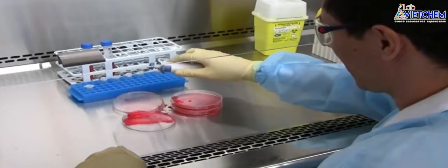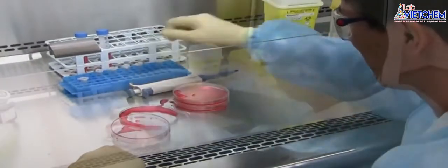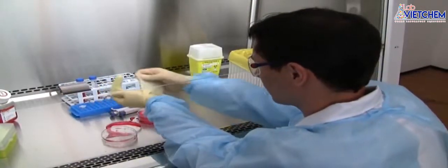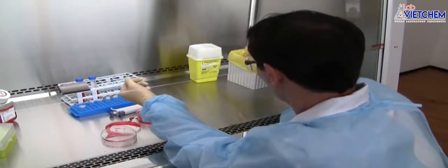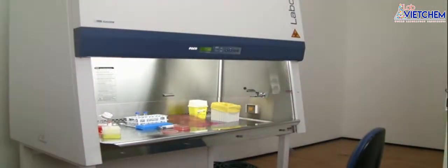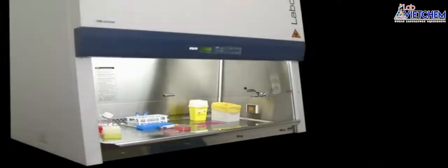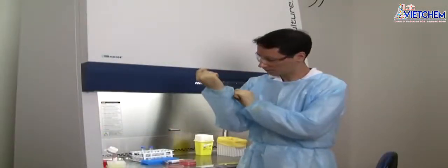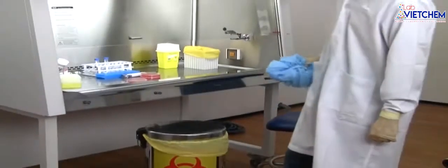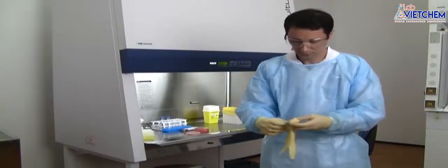If a spill should occur while working in the cabinet, do not turn the cabinet off. Remove your outer gloves inside the BSC as they may have become contaminated. Allow the cabinet to keep running as it will contain aerosols that may have been generated and will purge aerosols through the HEPA filter. Check your gown sleeves for contamination and discard the gown if it's dirty. Remove your inner gloves, wash your hands, and don a new gown and double gloves.